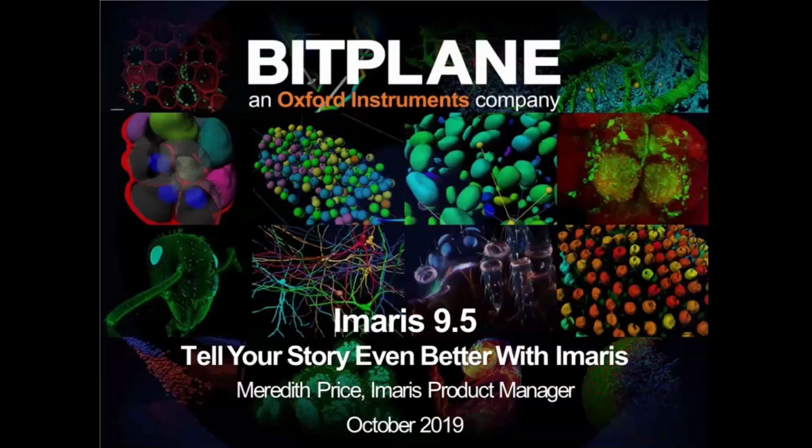I did not show vantage plots, but those are possible. These shortest distance measurements are used just like any other measurement, or what we call statistic, within Imaris, and so you can use them just like you would with others.